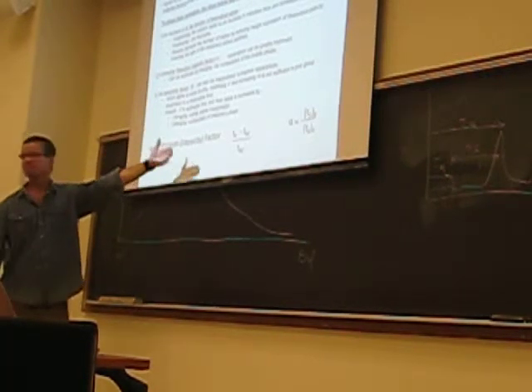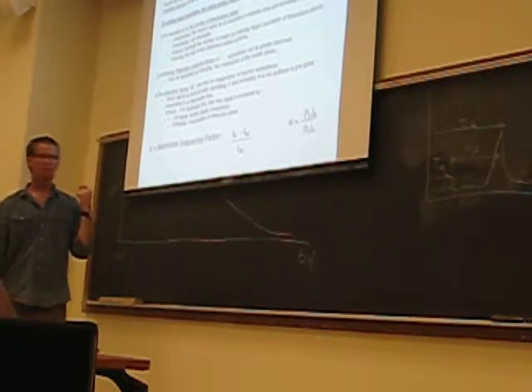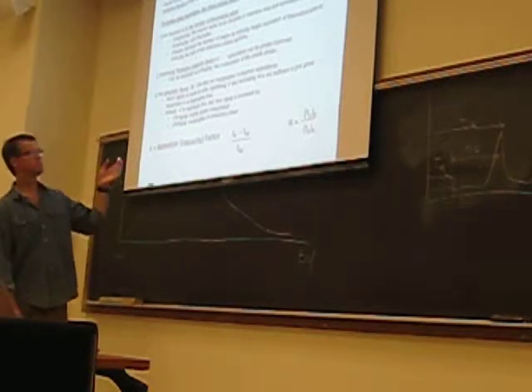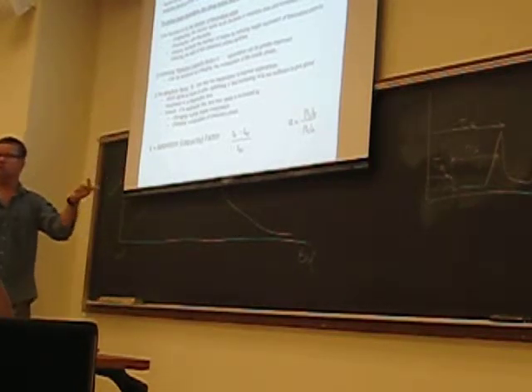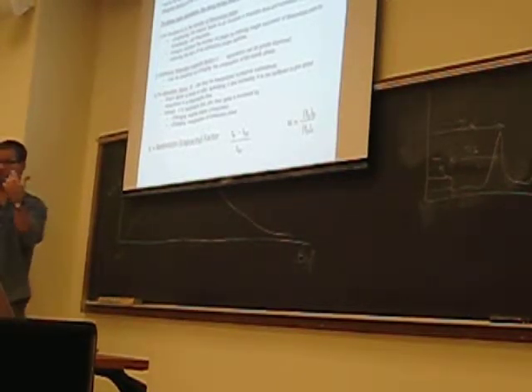So how do I optimize these parameters? You optimize these parameters by modifying the properties of the mobile phase. That's what it basically comes down to. You have control over which column you use, the properties of the column, and the composition of your mobile phase. Changing things like mobile phase flow rate has a small effect on resolution. It may have an effect on peak broadening and all those things that you're discovering with the Van Deemter equation, hopefully, but it has a very small effect on resolution.